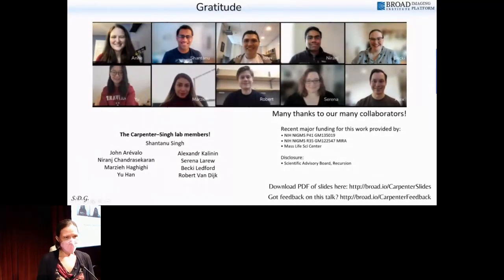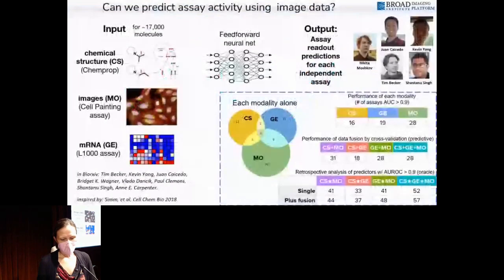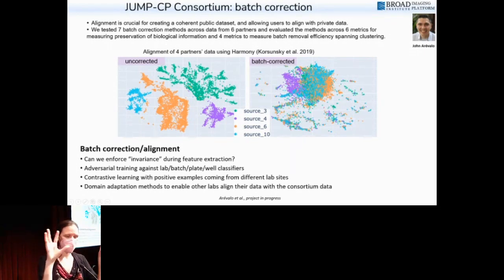Thanks, Sam. Beautiful talk. Question for you. Thinking about the drug screens, there have been large-scale differences in batch effects noticed, particularly on the genomics-based side. Have you noticed anything in cellular morphology? Yeah, for sure we have batch effects, and that's the one slide I skipped. If you download the slides, you can see the latest. Again, here we've taken methods from single-cell RNA-seq, a much bigger field with a lot more work going on. We took Fabian Theis's recent evaluation of all the single-cell batch correction methods, directly applied it, picked the best one, and moved on with our lives. We really are appreciative of folks working in adjacent fields here.